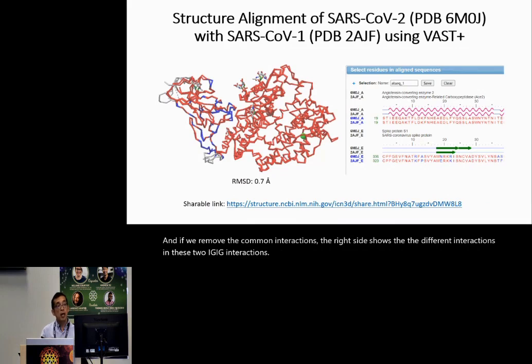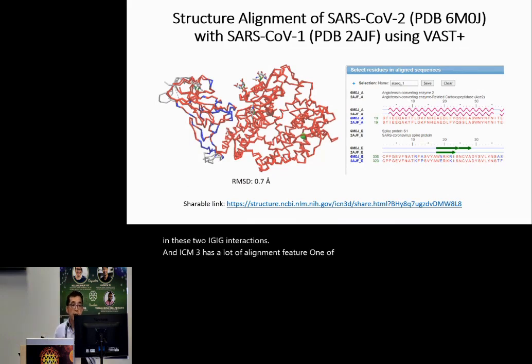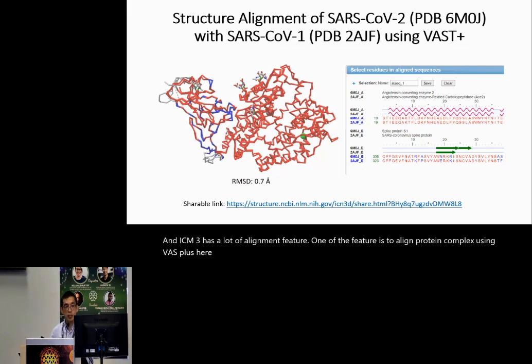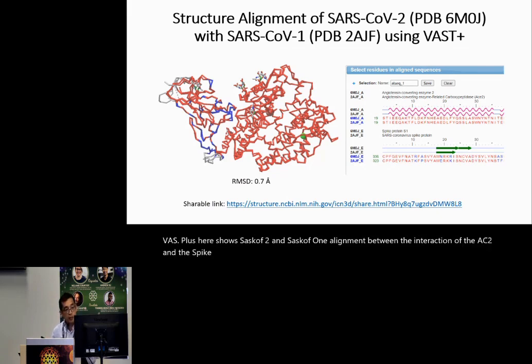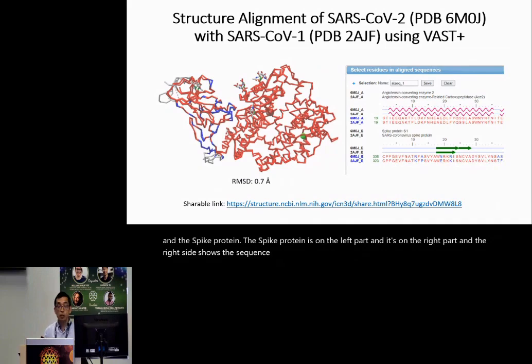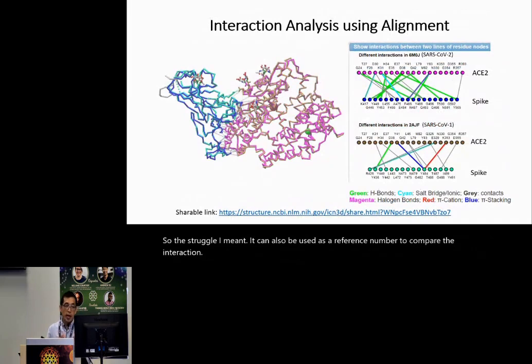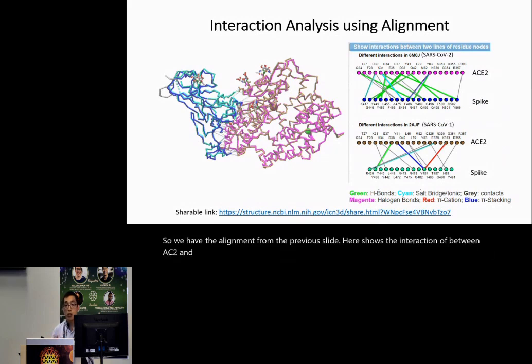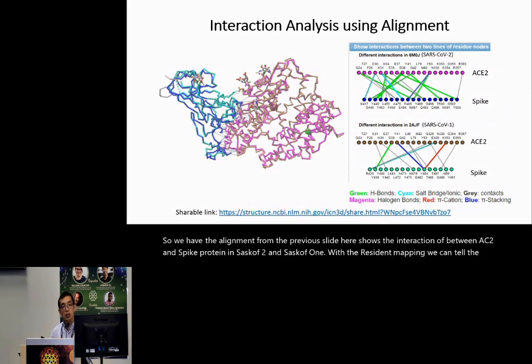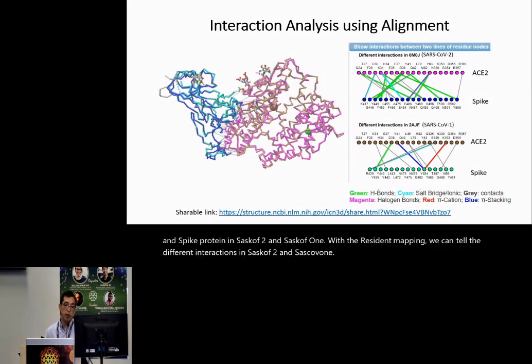ICN3D has many alignment features. One feature is aligning protein complexes using VAS+. Here is the SARS-CoV-2 and SARS-CoV-1 alignment of the interaction between ACE2 and the spike protein. The spike protein is on the left, ACE2 is on the right, and the right side shows the sequence mapping based on structure alignment. The structure alignment can also be used as a reference number to compare interactions, allowing us to identify different interactions between SARS-CoV-2 and SARS-CoV-1.